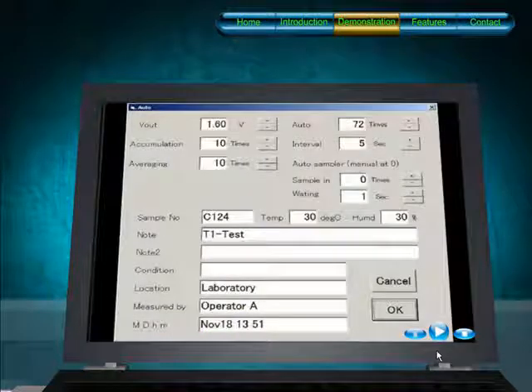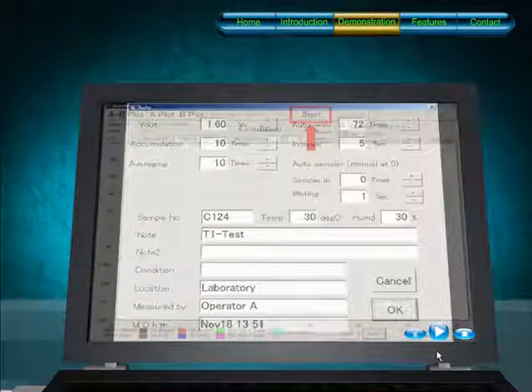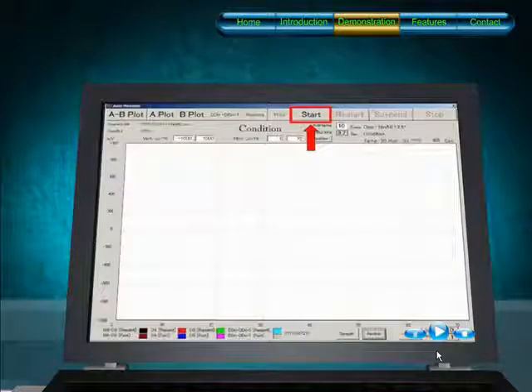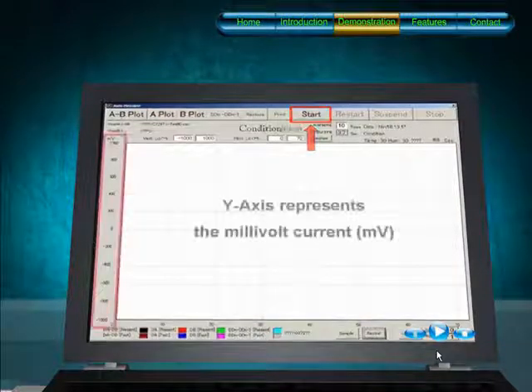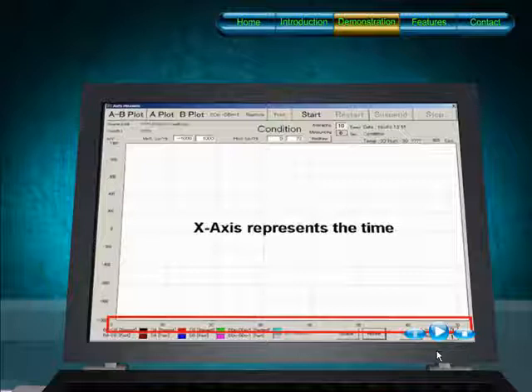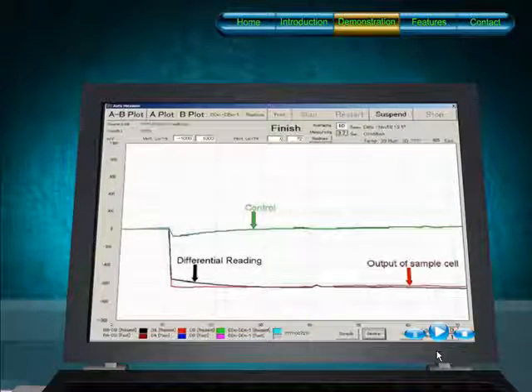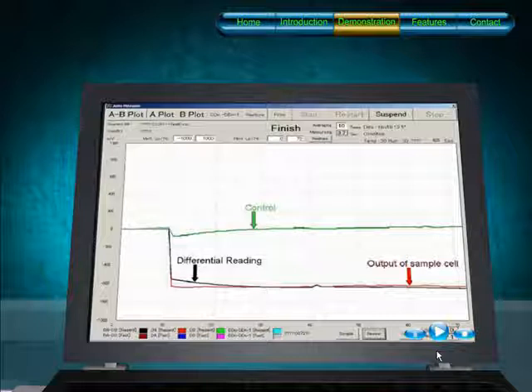Here we input the appropriate parameter settings. Measurement begins now. The Y axis represents the millivolt current, while the X axis represents the time. The output of the sample cell is shown as the red line, while the green line represents the control. The differential reading is reflected as the black line.